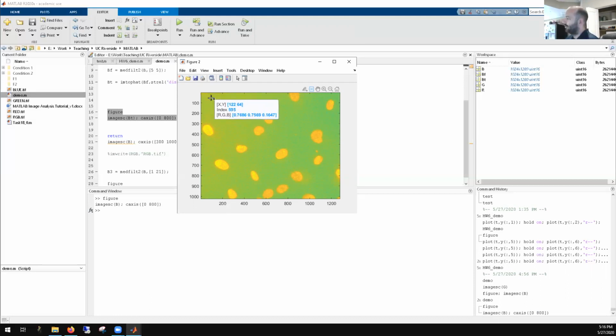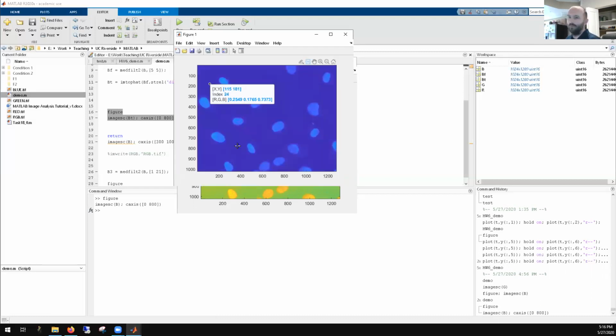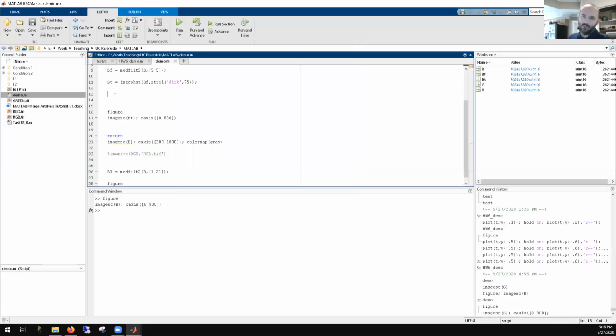Basically, we have a really narrow window between the intensity right here and the intensity right here. But with Tophat filtering, we've eliminated that. Now these values are in the 10s and 20s, and this value is in the hundreds, and maybe as low as 90. So if we want to identify the bright objects from the dim objects, all we have to do is use a logical expression.